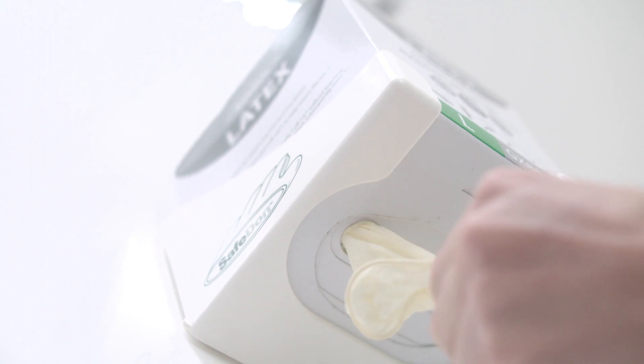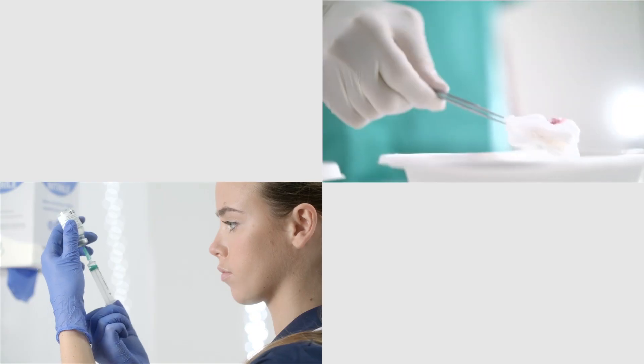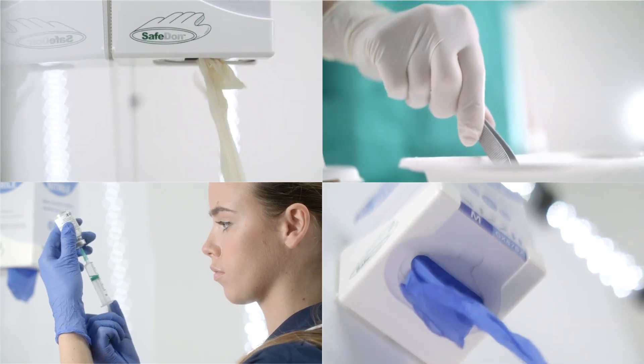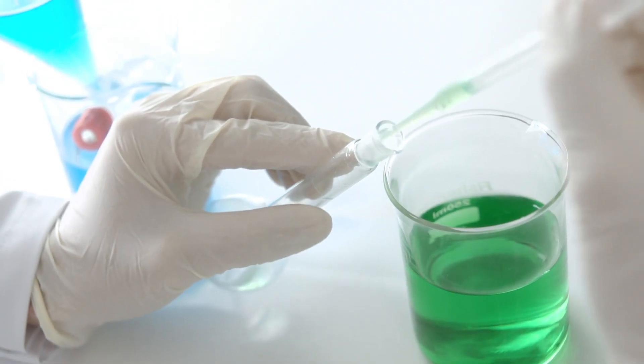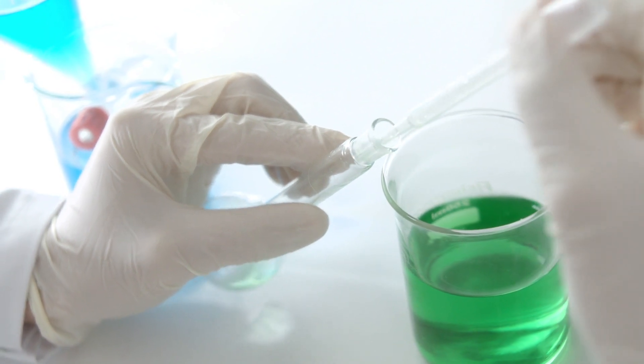Easily wall-mounted in the areas where most needed, the dispensing unit keeps gloves away from contaminated work surfaces, preventing cross-contamination by up to 96%.